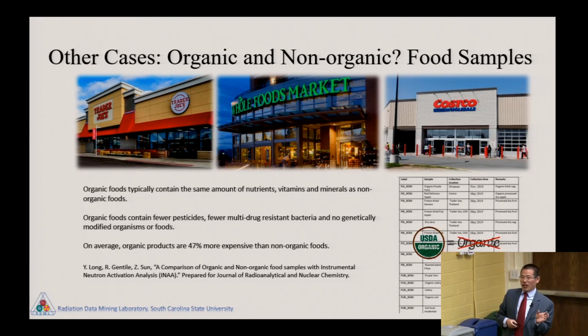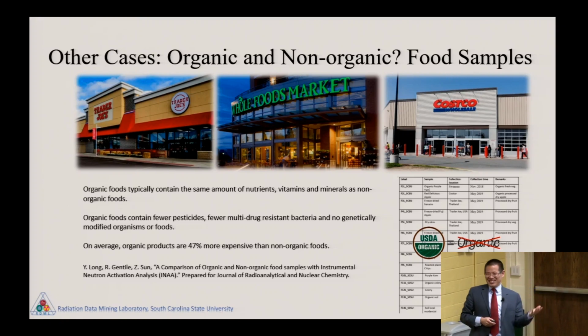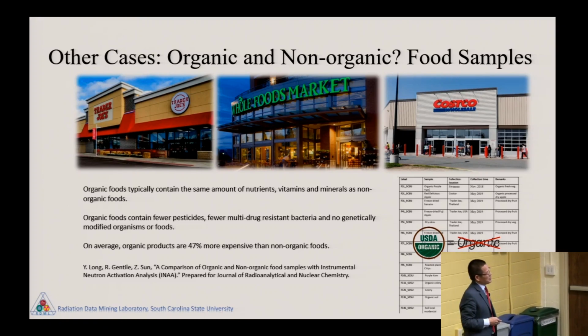But I can tell you the results. I do not see any difference. Not a big difference between organic and non-organic. The heavy metal content is very similar.